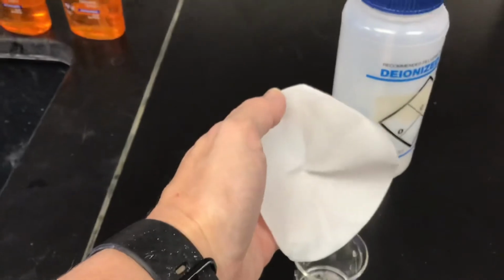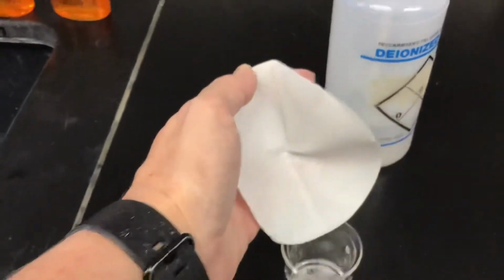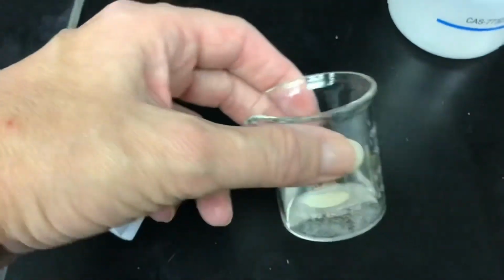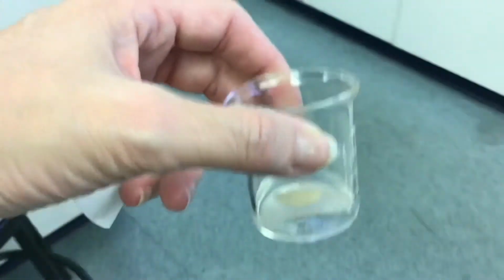Okay, so I just sprayed the filter paper. I opened up the filter paper and I sprayed the squirt bottle down it. And you'll notice that all of my sand is right inside this beaker 3 that I know the mass of. So I have a little bit of water in there, and I have my sand from my sample.